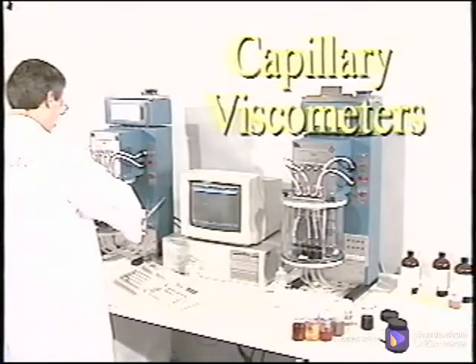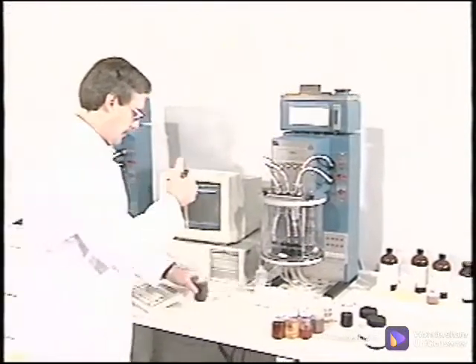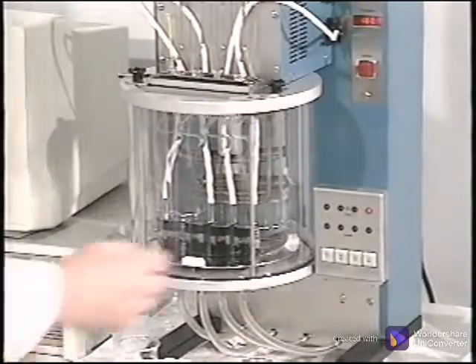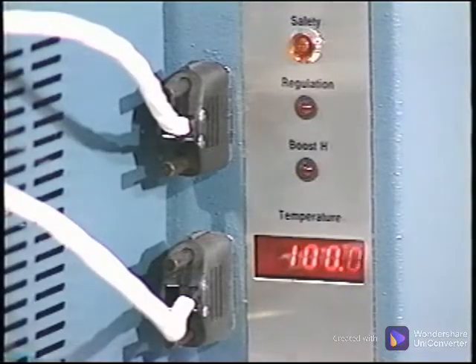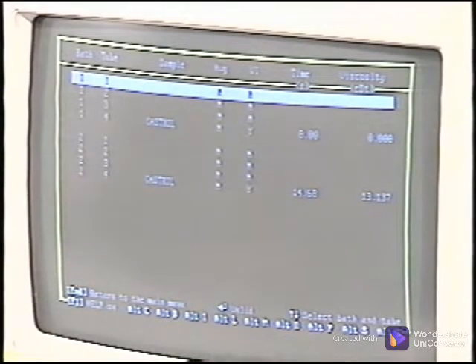The sample is then processed through these two capillary viscometers to determine the exact viscosity and analyze the quality of the base stock. The oil is deposited into capillary tubes where the flow is timed after it is heated by the solution to 40 or 100 degrees centigrade temperature. The viscosity is measured in centistokes and then given the corresponding viscosity index.